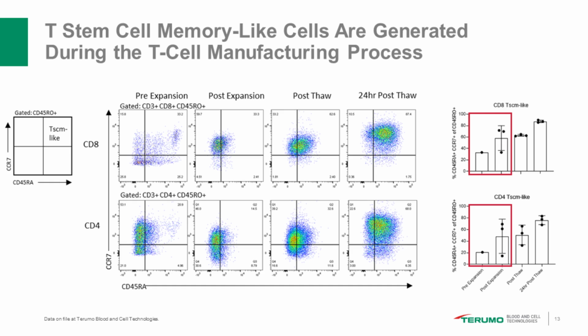As we go through the manufacturing process, you can see there's an increase in enrichment and representation of those cells throughout the expansion.